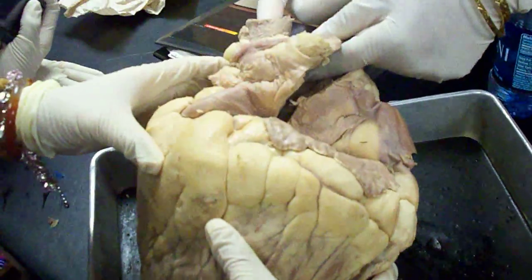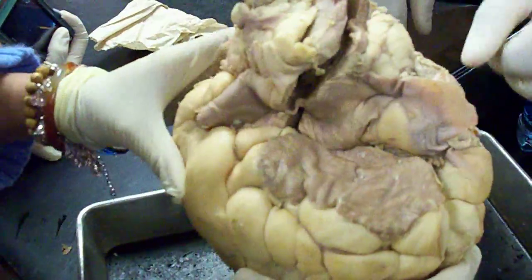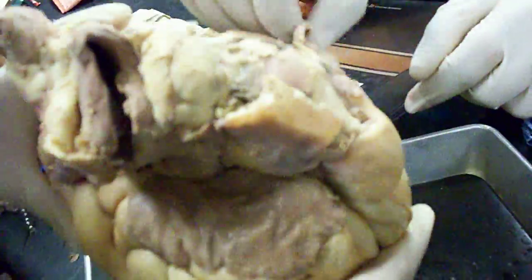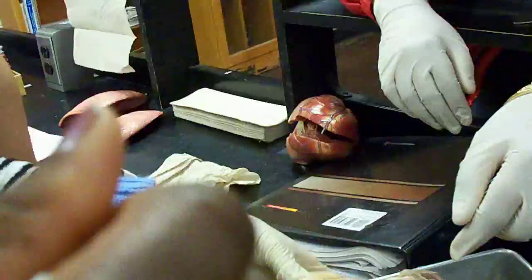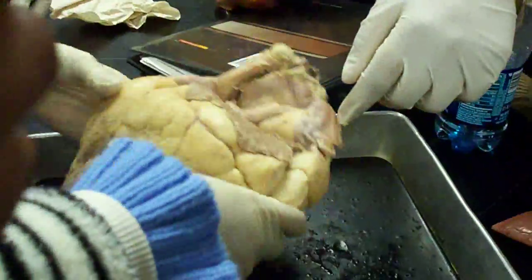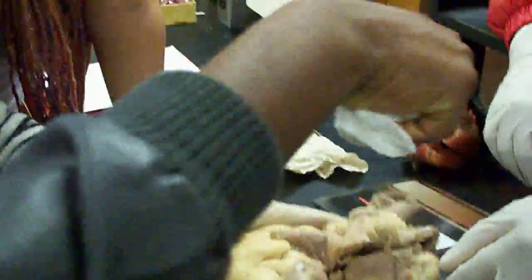Pulmonary trunk, and then this is the aorta right here. And the other one is the superior vena cava. It's supposed to be three. There it is — aorta is in the back. This is the superior vena cava. And then there's your brachiocephalic. The second one.